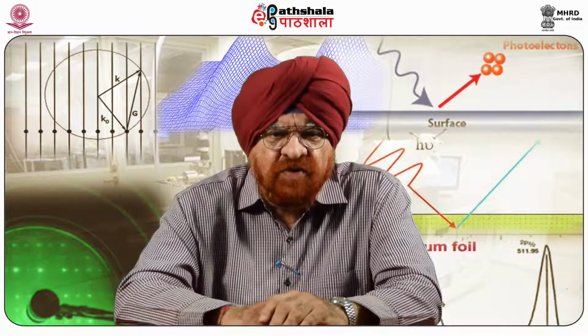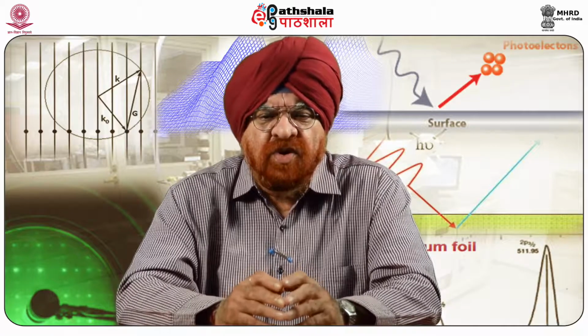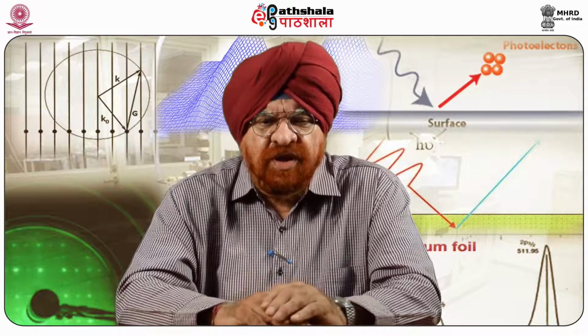The tip-surface interaction deflects the cantilever, which gives information about the surface topography. Samples can be analyzed in air, liquid, or vacuum. Resolution in liquid and vacuum is increased because of the absence of strong capillary forces due to a thin liquid film on all samples in air.